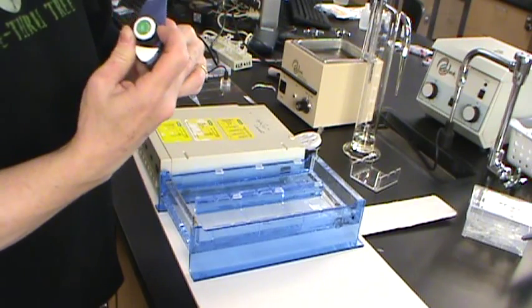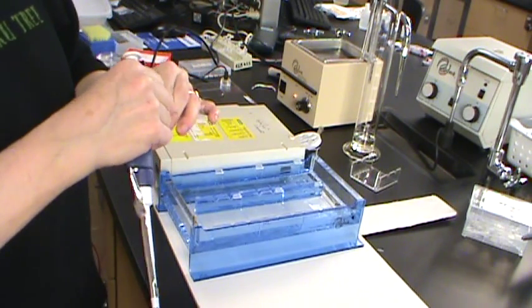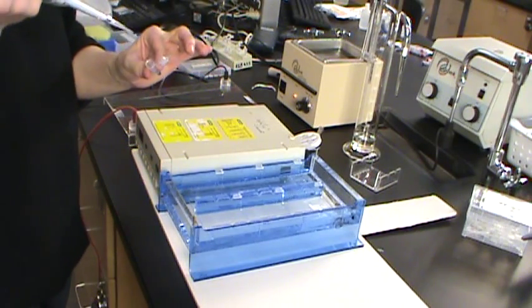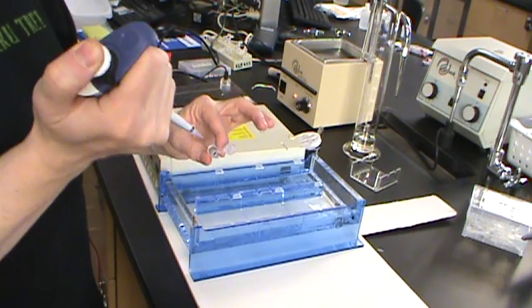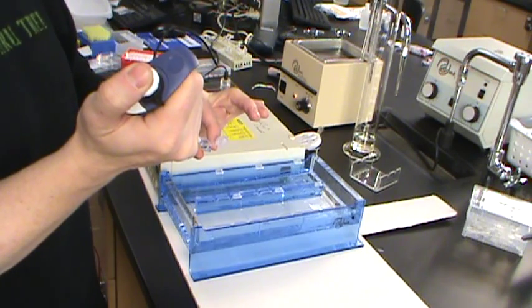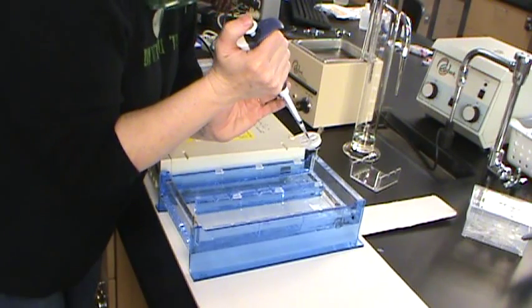However, it's not necessary that that's exactly 40, but that's about the amount that will work best for this. And we'll put our plunger down to the first stop, into our sample, just under the surface, let it up, and we're going to apply that to our wells.